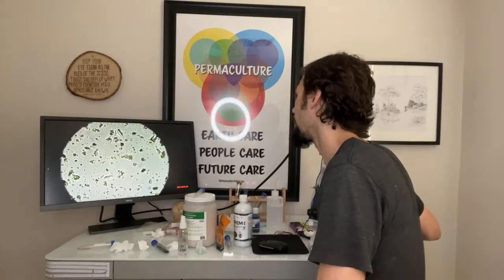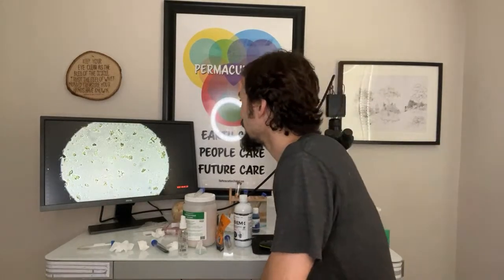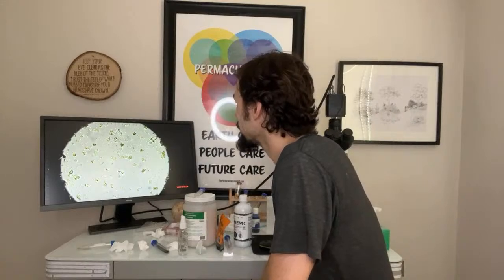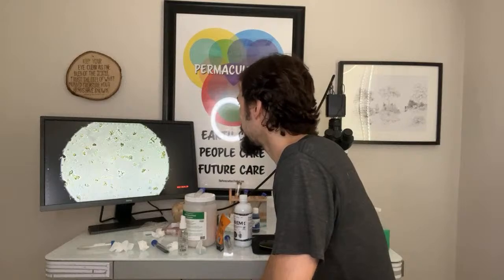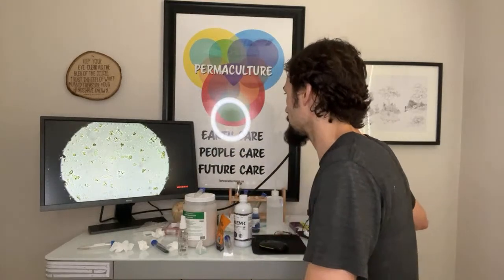Oh, wow. So there are some really tiny bacteria in this. There's also larger bacteria in this. And they went with their spores. So I see spores there. Let me just make sure.